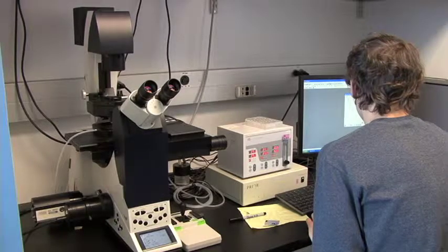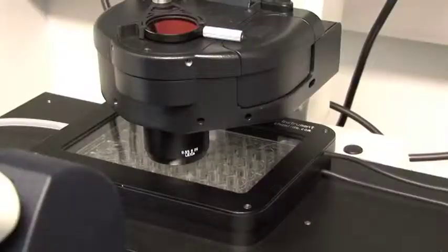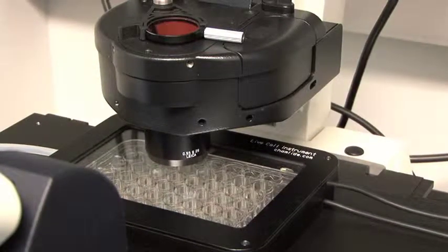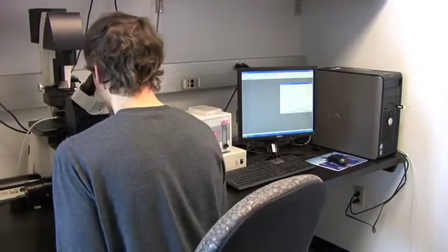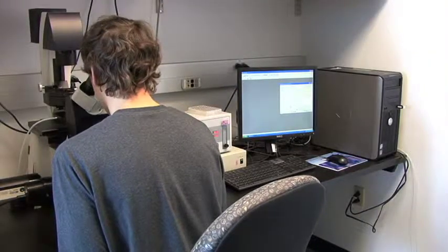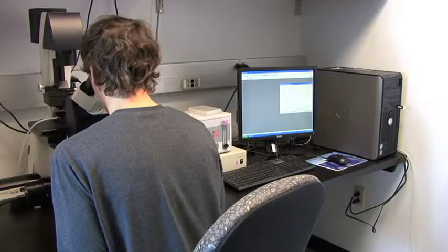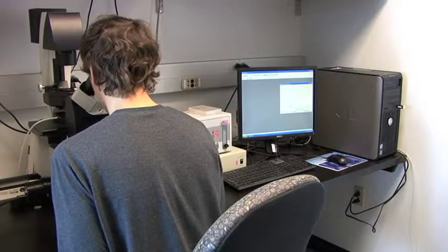The plate is then placed on the time-lapse microscope. This microscope captures the location of the cells every 5 minutes. Now I'm going to pick positions for my cells. My cells are plated on a 48-well plate, so I can test different conditions in each well.